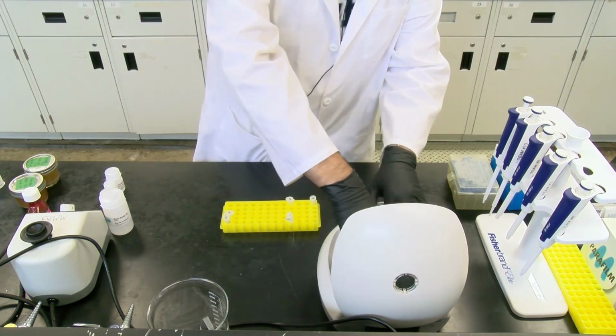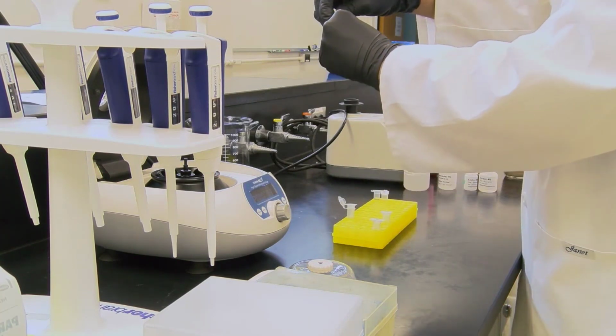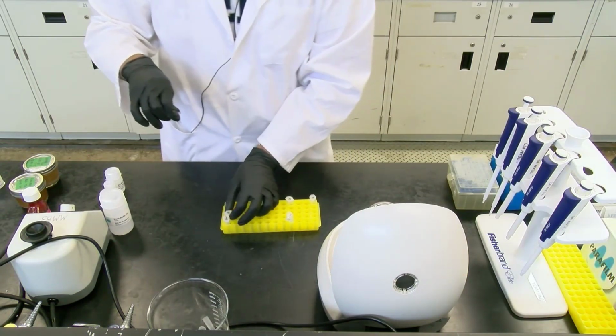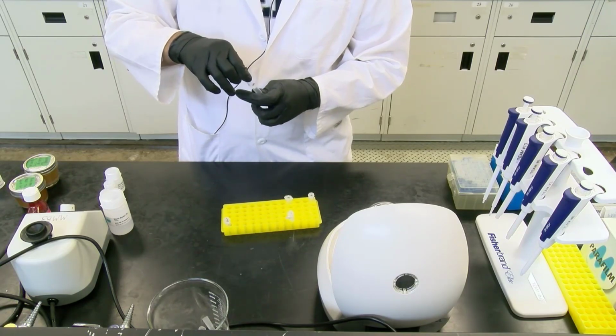We're going to do the same thing with sample P. We want to go slowly, make sure we don't touch the sides or anywhere where ethanol may be. We can discard this and put it into a fresh tube.